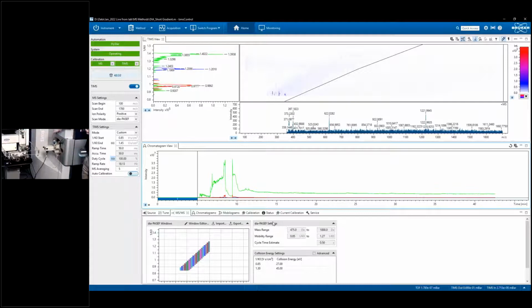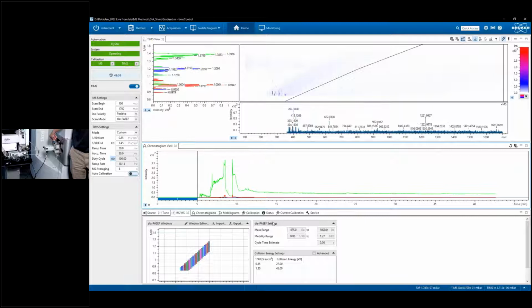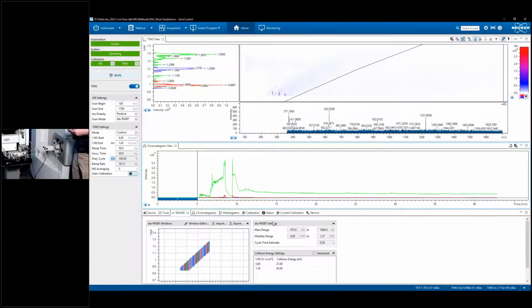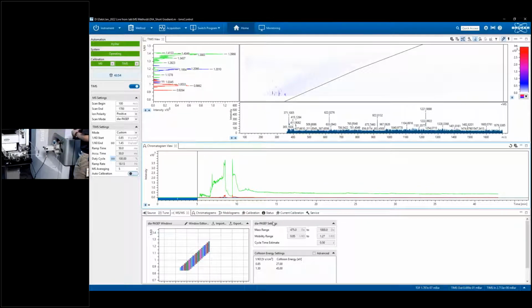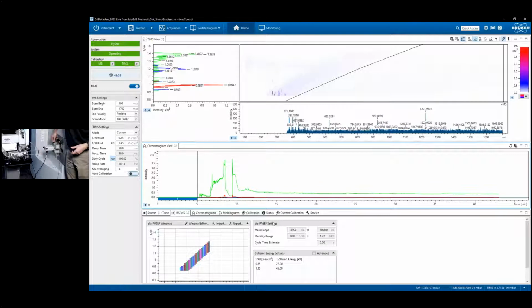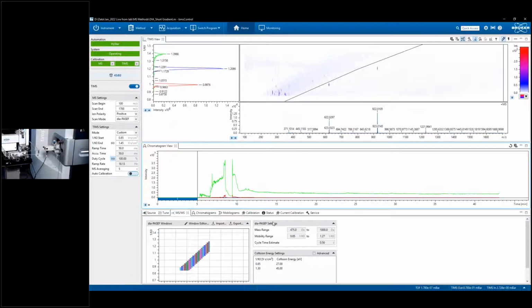What you'll see on the top of our CaptiveSpray source is this filter system here. So this is just a couple of filters here, which filter the lab air that we use to focus the spray onto the inlet to the mass spectrometer. So normally you have just an empty filter running here, just to remove any contaminants from the gas flow through the system. But to calibrate, very straightforwardly, I'm just going to replace that filter with a filter that I have previously spiked with some calibration materials.